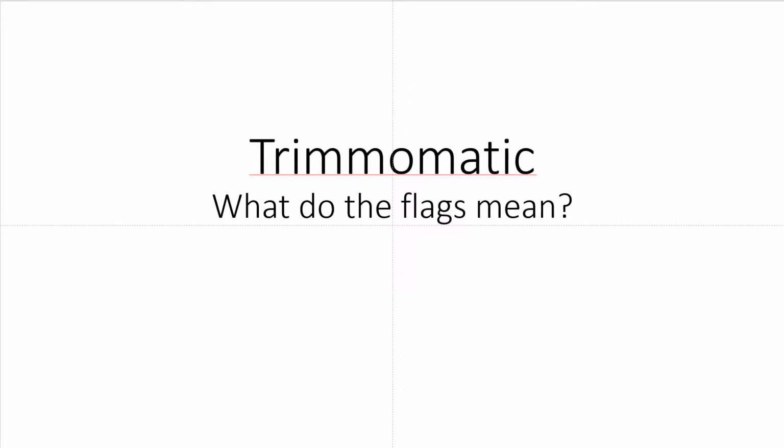So instead of just blindly running the tool, copying and pasting, which I've noticed some people do when they're going through tutorials and not really understanding what they're doing, we can go through and learn a little bit about what actually is happening with Trimmomatic when we're running it.